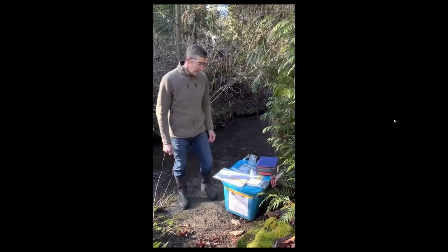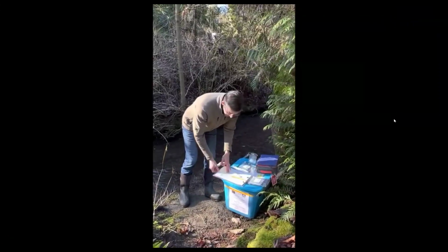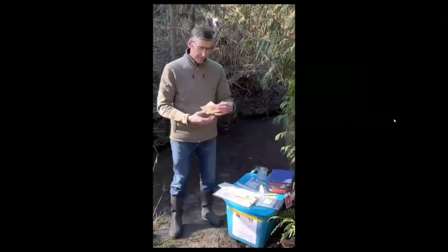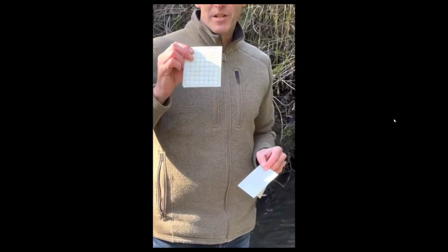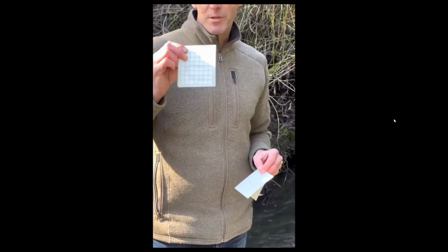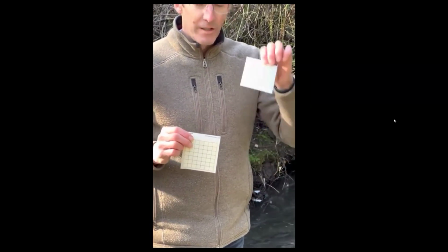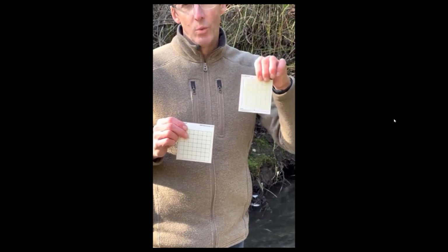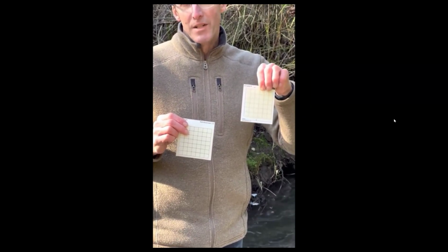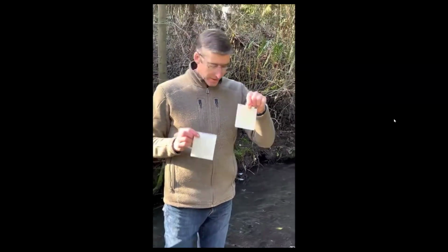So R cards come in a variety of sizes and types. We have a couple different types here. We have the R card ECCA, and this is designed for up to a 3 ml sample. So you can see this is a larger card. And then we have the R card ECC, which stands for E. coli and other coliform, in the 1 ml sample size. So you can do a maximum of a 1 milliliter sample with this one.